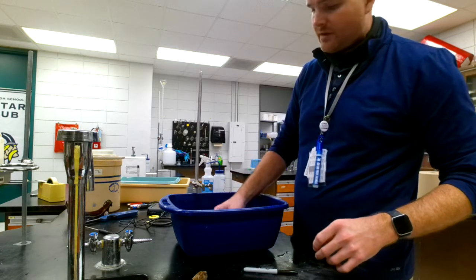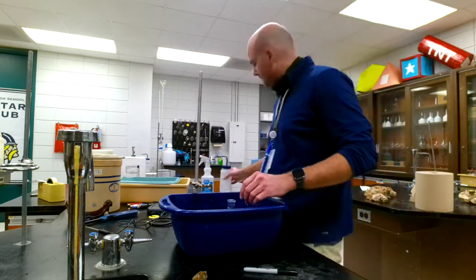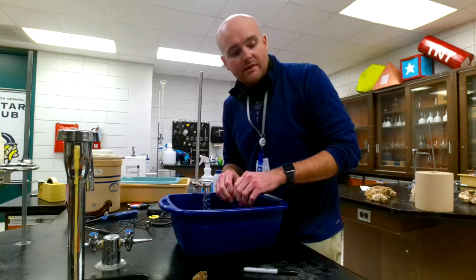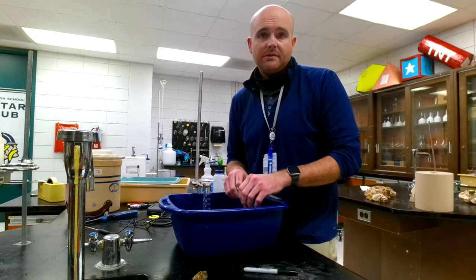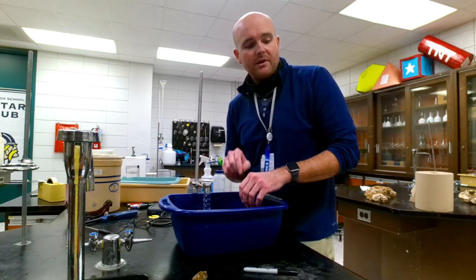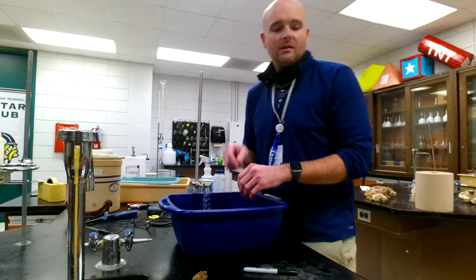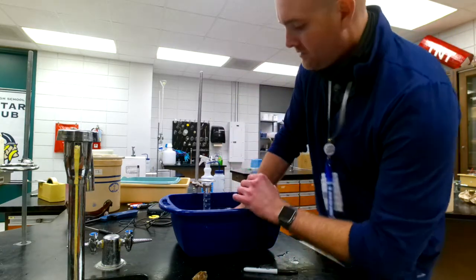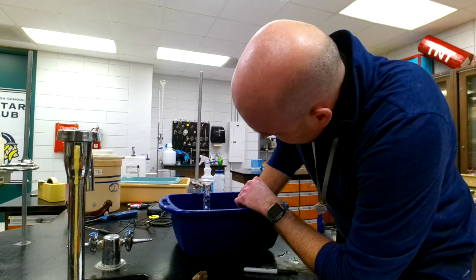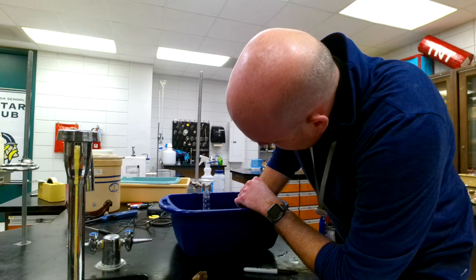Last trial, because that first one was bogus. We are going to recycle the final mass from the previous one. Won't weigh it again. It'll be 21.3581. That is going to be your new initial mass. So let's go ahead and do this right now. I hope there's enough gas in here. So, no, we're running out of gas.